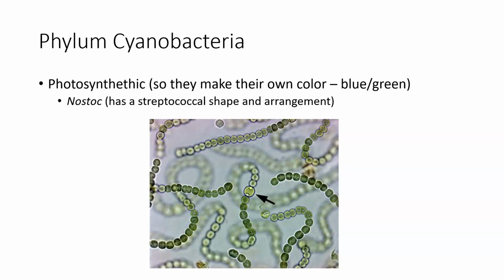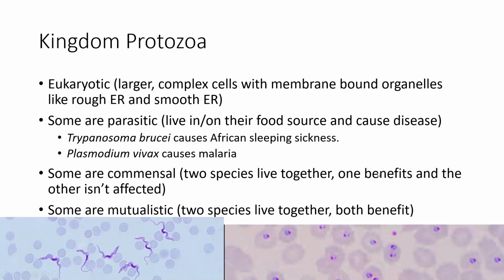They put photosynthetic bacteria, formerly called blue-green algae. The name is Nostoc, so this is what you would put in the organism group. Kingdom, still bacteria. Phylum is Cyanobacteria. So these guys don't have to be gram-positive or negative because they make their own pigment. They look bluey-green under the microscope even when you don't stain them. And so if you're looking at bacteria and they happen to be green, then you know it has to be Cyanobacteria. This is where that game Among Us can help people out because apparently one of the creatures is called cyan. Well, cyan has always meant blue-green. There you go. All right.